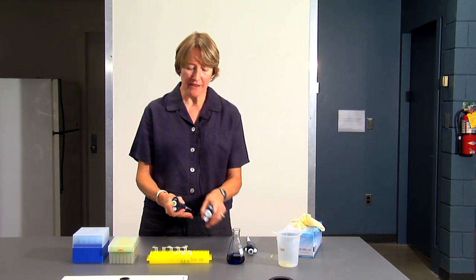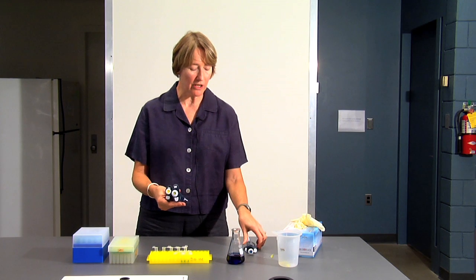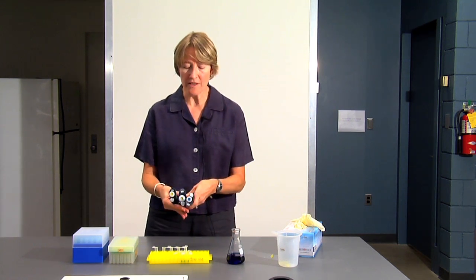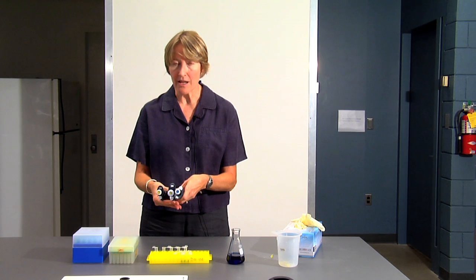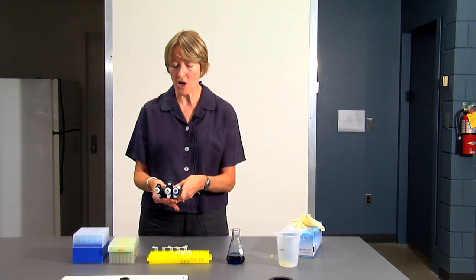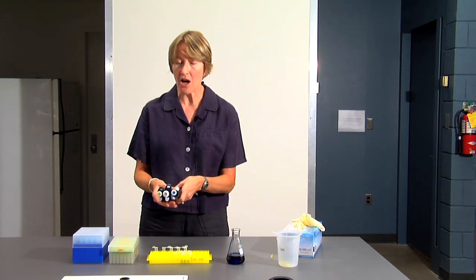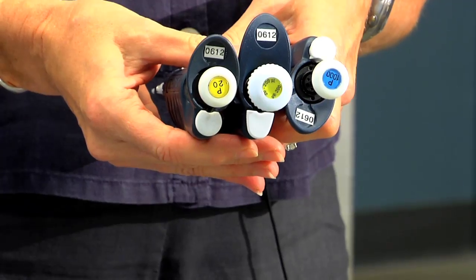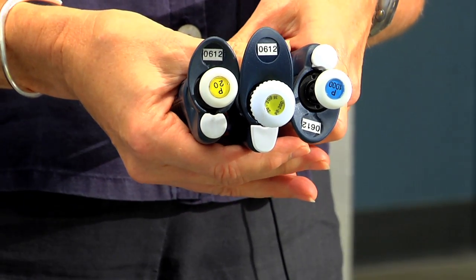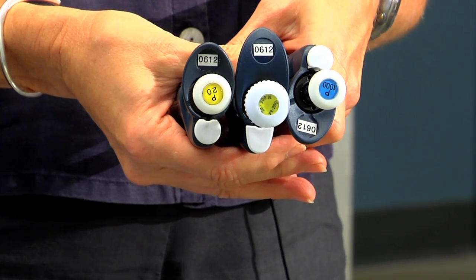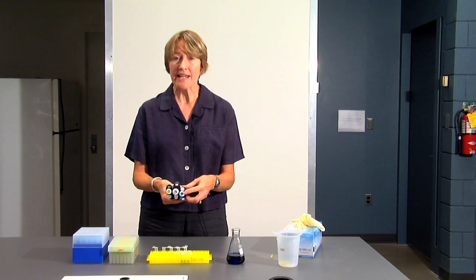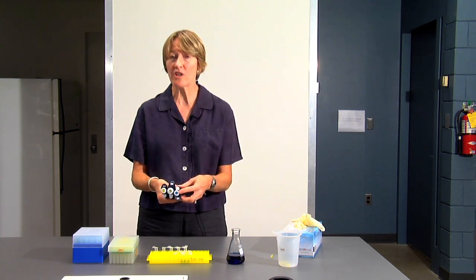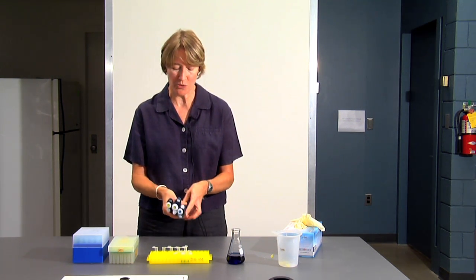I want you to notice that the pipettes are color coded, and that on the top of the plunger, you'll see either a yellow dot on the P20 and the P200, you have a yellow dot on the plunger. On the P1000, you have a blue dot. This color coding tells you which size and which color pipette tips to use.